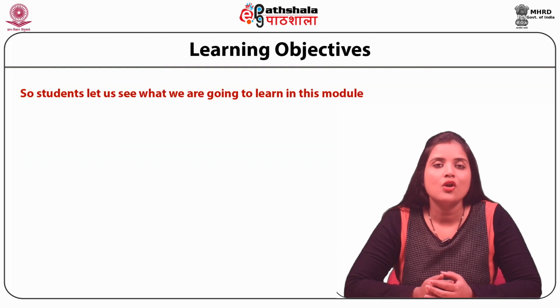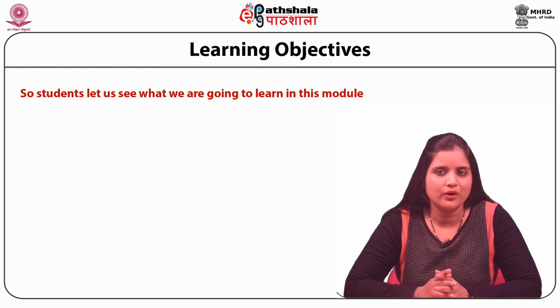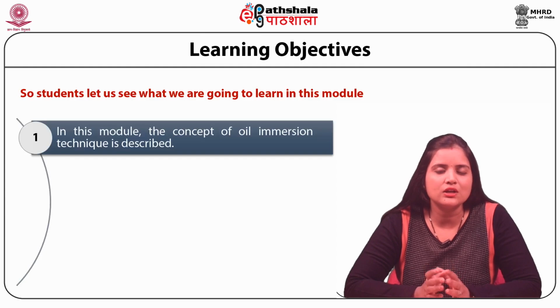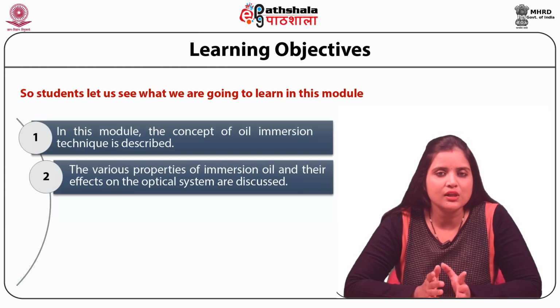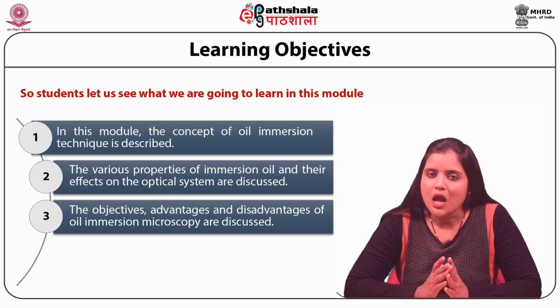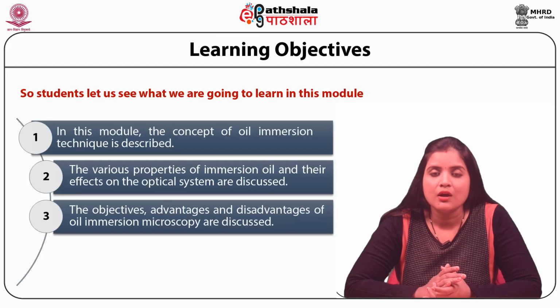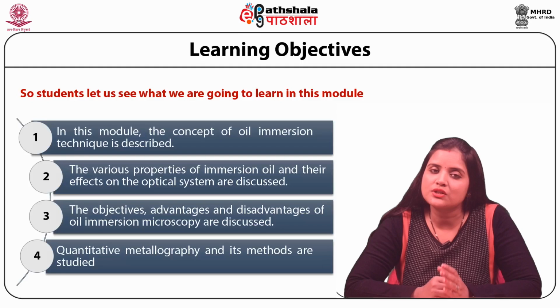So students, let us see what we are going to learn in this module. In this module, the concept of oil immersion technique is described. Then, the various properties of immersion oil and the effects on the optical system are discussed. The objectives, advantages, and disadvantages of oil immersion microscopy are discussed in this module. The quantitative metallography and its methods are studied here.